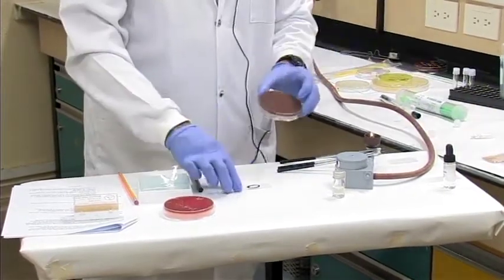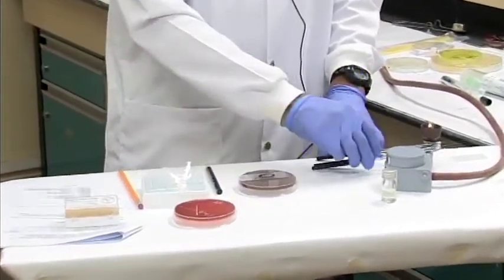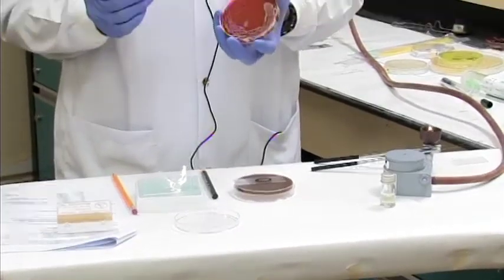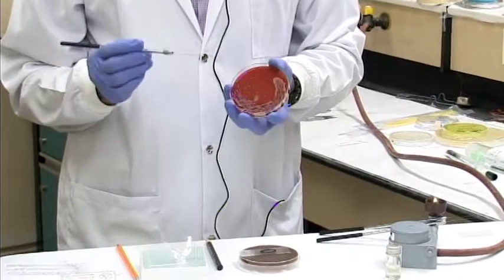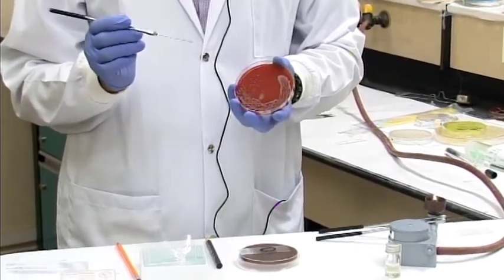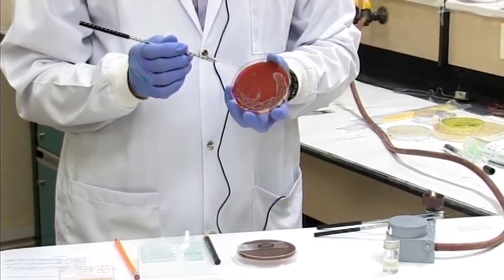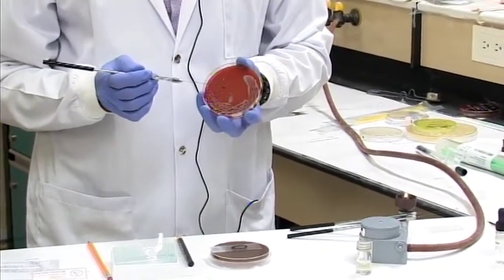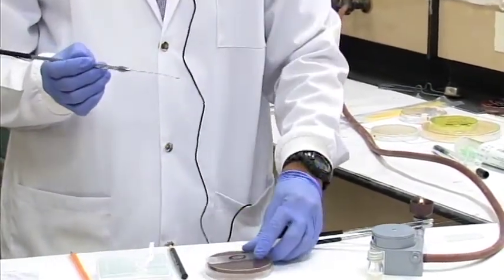So I'll use a plate here as a background to show you some contrast. Use a cool loop, and we're going to pick up a colony of bacteria. Now the bacteria would have been streaked previously on a plate to give you colonies. If at any time you're unsure whether the loop is cool, you can just touch the loop on a clear part of the agar plate to make sure it's not hot, and simply touch one colony, which is one of these little dots, to do your Gram stain or make your smear.